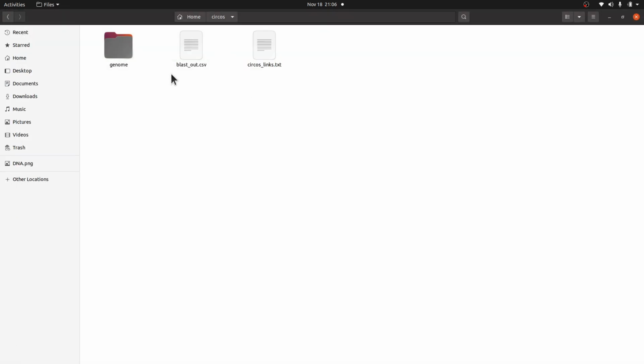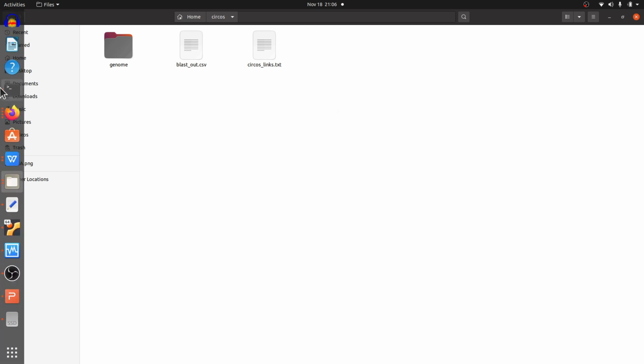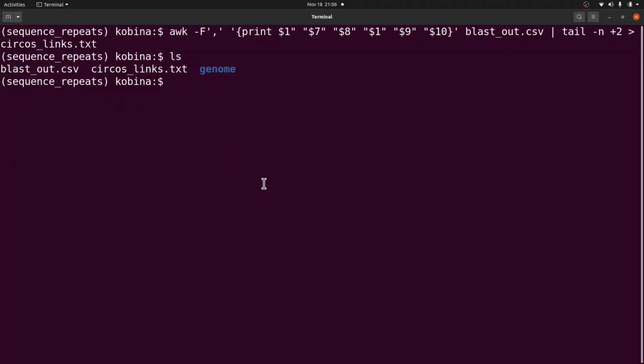That's for Circos. Now this is one of the inputs for Circos. But with Circos, we also need to generate what we call a karyotype. So we are going to generate a karyotype using our terminal. This is just one chromosome, so we will do it on the terminal. We are going to say echo, I bring a double quote, I'll say chr - CHR1 AJY99. That's the name. If you've watched my videos on Circos, then you know the format for creating a karyotype. That's what I'm doing.